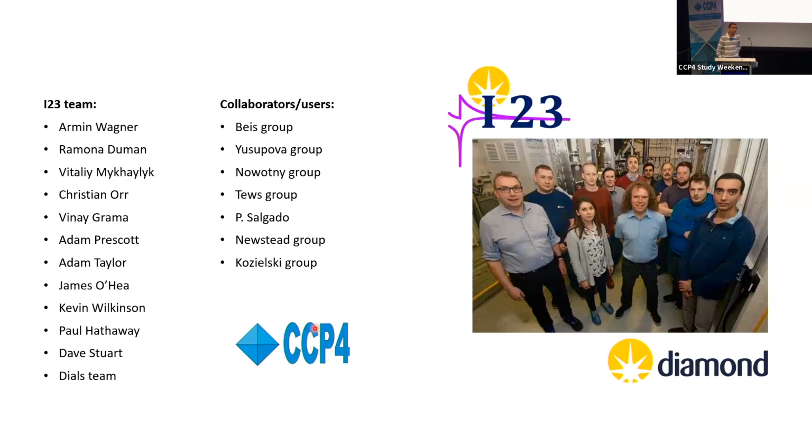By burning, you mean? Yeah, when you have bromine, yes. With bromine, it's routine. You get negative difference density, presumably because there's massive radiation damage. I mean, most PDB ligands with bromine have radiation damage. So, is it worthwhile thinking about doing that as well? So we never tried that because we tend to collect very, very low dose and high multiplicity. But we can easily collect high dose and low multiplicity to test that. But we tend to be very, very careful with dose. So we never actually thought about it. But yeah, that could be tried.